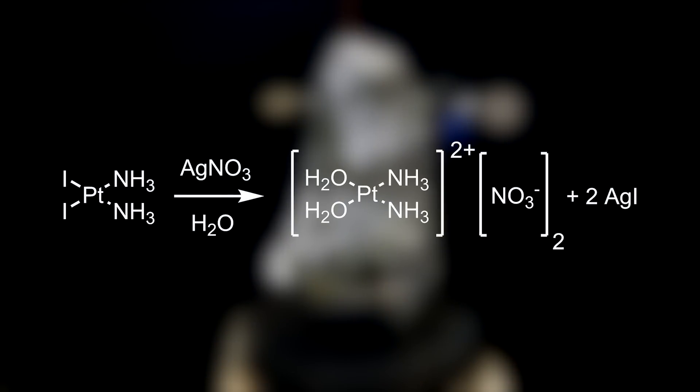In the reaction, silver nitrate oxidizes the platinum, ripping off the two iodines to form silver iodide. Two water molecules then coordinate to the platinum, forming a 2 plus complex, of which the remaining nitrate ions balance the charge.